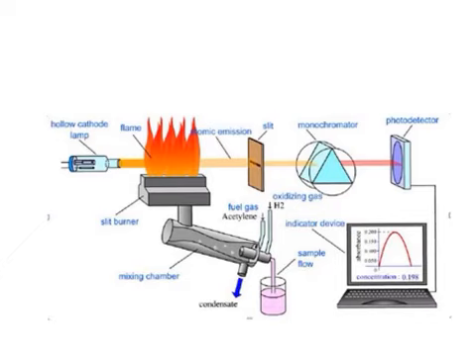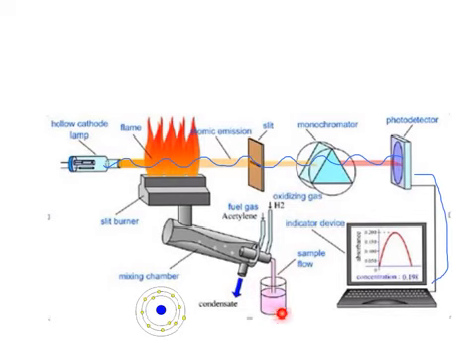So imagine you have a transmitted wave passing through the flame sample. Signal is going to here. Now in this case we have a solution of sodium chloride. As the sample gets drawn up and into the flame, these atoms are in the right kind of state to absorb this light energy travelling through the apparatus. So this time some of the light waves get absorbed by these atoms. This means your detector shows an absorbance, which is shown on the computer monitor.